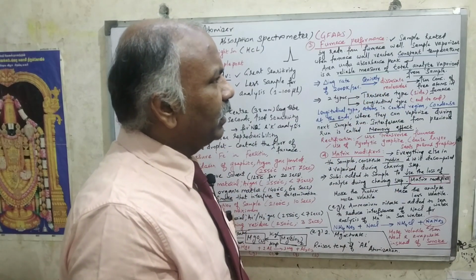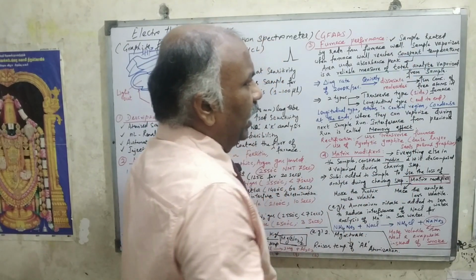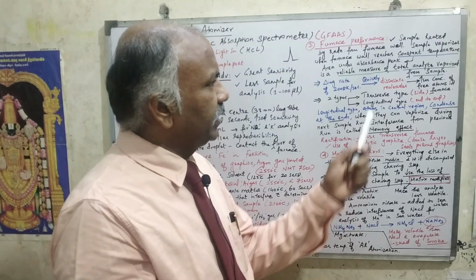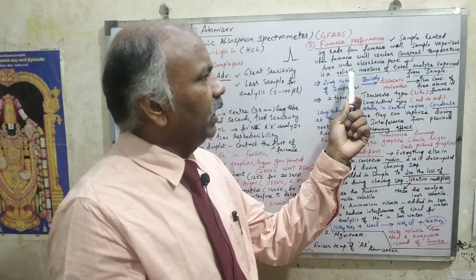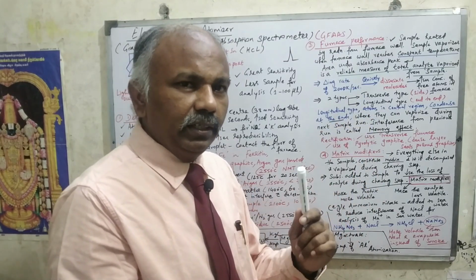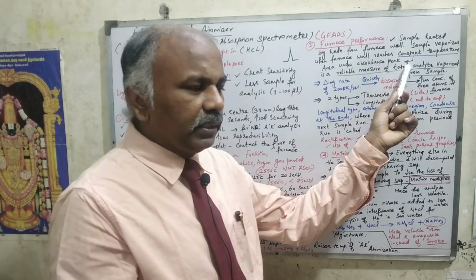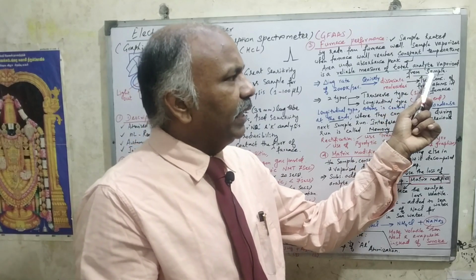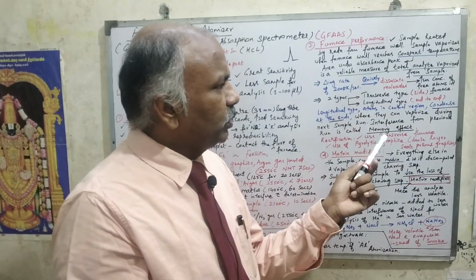So whenever we go for the sample heated by radiation from the furnace wall, the sample vaporizes when the furnace wall reaches a constant temperature. So the temperature inside the furnace should be very, very constant. Then only the sample will undergo the vaporization. The area under the absorbance peak at a constant temperature is a reliable measure of total analyte vaporized from the sample, right? So this is the way you should remember that.